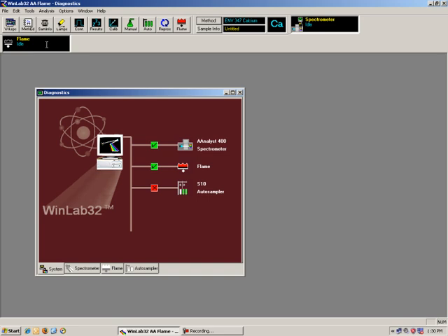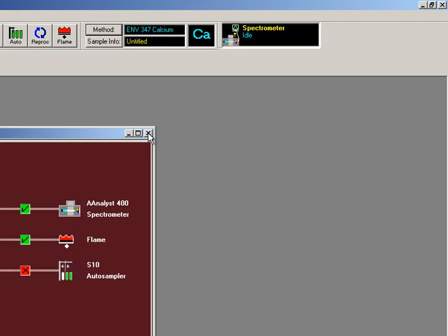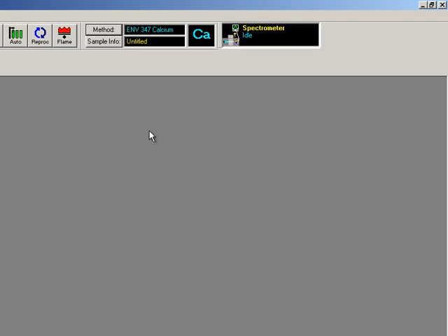In the previous video I showed you, if you get an interlock here, how to address that by putting water into the waste container U-tube. If these are all clean, you can, the auto sampler one will always show a red X because we're not using the auto sampler and it's not turned on. We can X out of there.